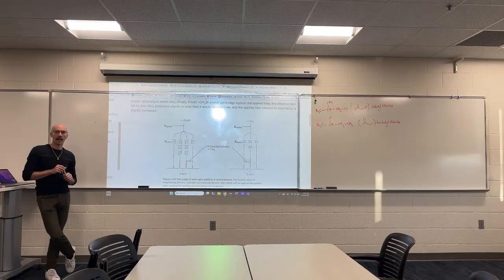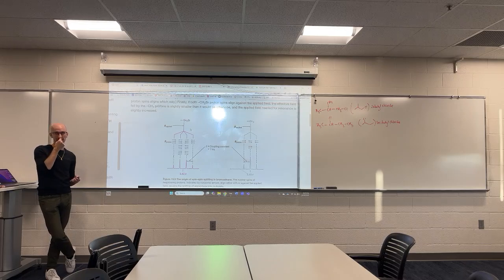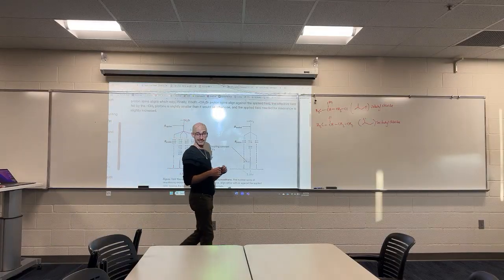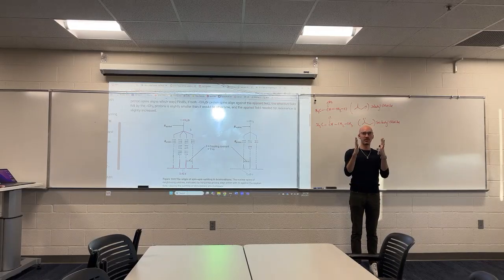Do you remember when we introduced NMR? The foundation of what we said NMR works with? What it's looking for? So the magnetic field interacting with the nuclear spin. Yep.